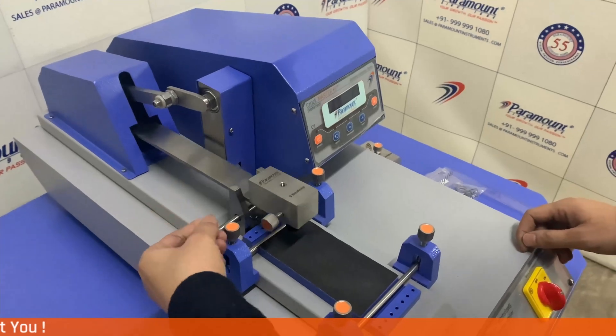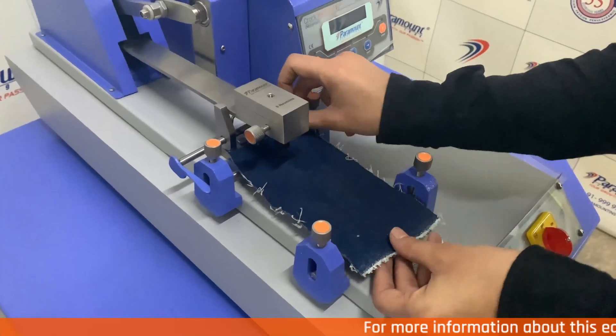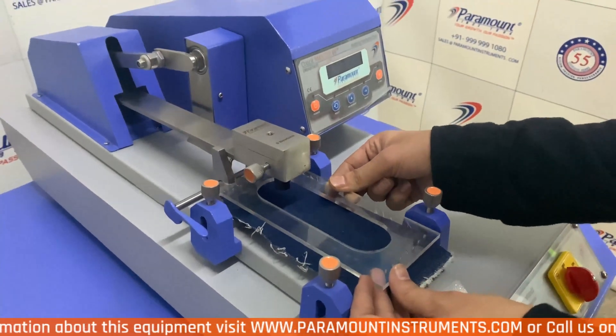To start the test, first we need to lift up the finger with the help of the lever provided, then place your sample and adjust it. After that we need to cover the sample with the acrylic sample fixing holder.